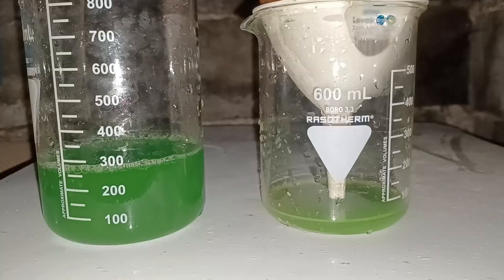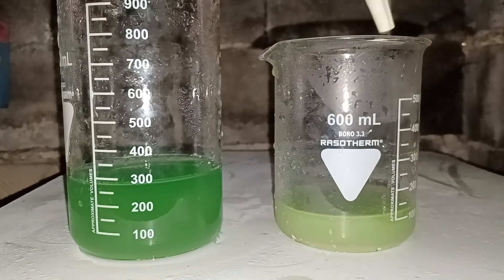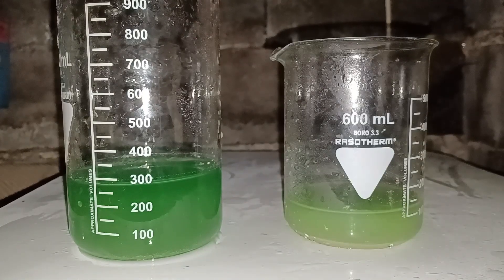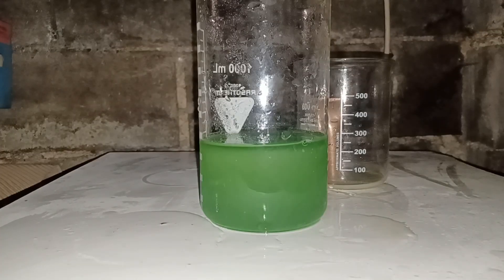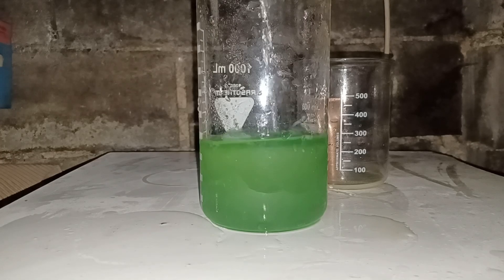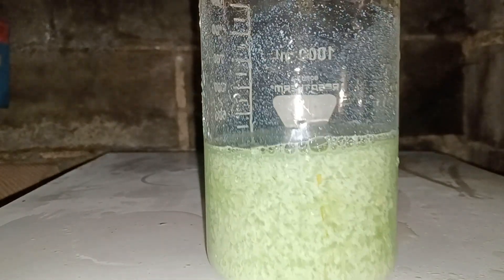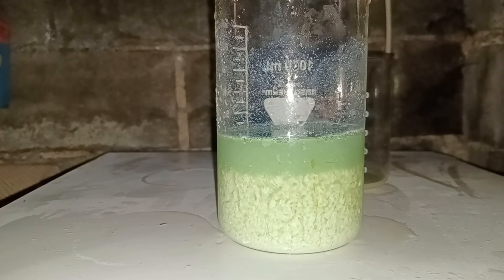I dealt with the majority of the sediment by carefully decanting the solution. Then I added hydrochloric acid to precipitate silver chloride. Silver chloride always forms this fluffy-looking precipitate, so it might appear that there is a lot of it, but this really isn't a big amount.